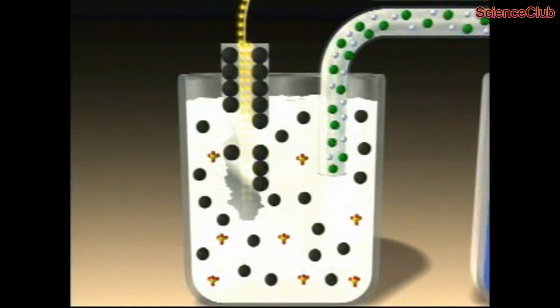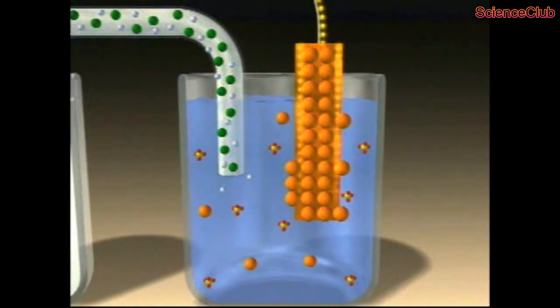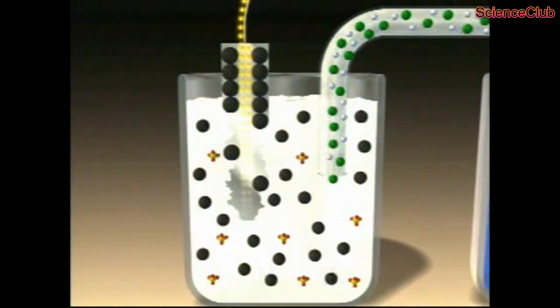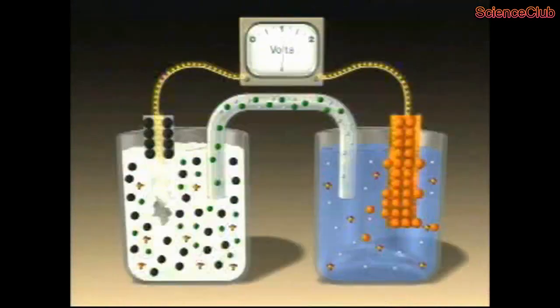As the reaction continues, excess positive zinc ions build up in the zinc solution. At the same time, the loss of copper ions from the copper sulfate solution creates an excess of negative sulfate ions. Positive sodium ions migrate into the copper sulfate solution from the salt bridge, while negative chloride ions migrate from the salt bridge to the zinc solution and maintain neutrality of the solutions.